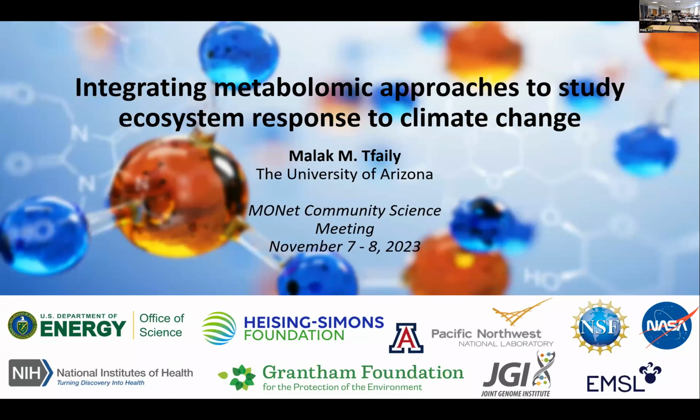Yes. So one of the things I debated was how much mass spec technology to discuss. There's at one level, bigger magnets are better. There's an intrinsic physics associated with that. But there's also everything else that goes into it, including the instrument design, the electronics that are associated with all of these things also have an influence on our sensitivity and on our resolution. And so what actually happens is that our 7 Tesla is able to achieve resolving powers like a 14 Tesla because of some clever tricks that go on in the electronics.